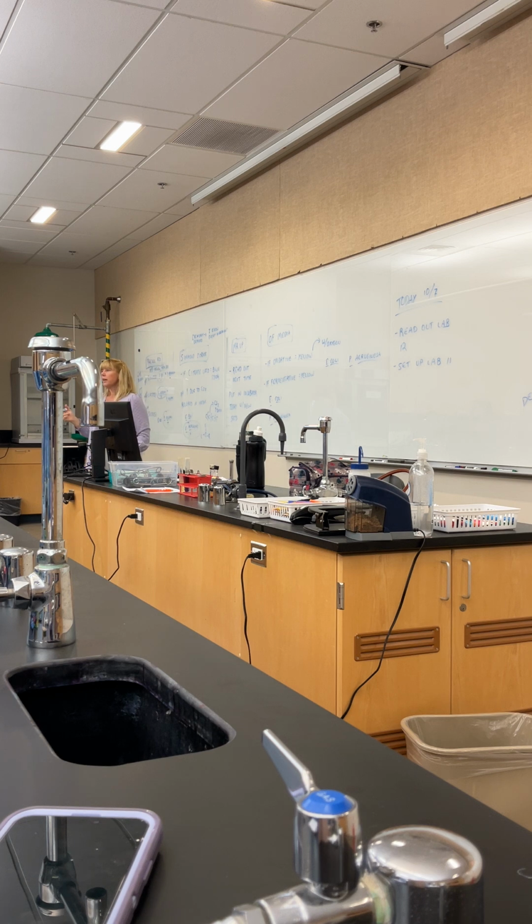That makes sense, right? What did we learn about Pseudomonas in our lecture? What kind of atmosphere does he prefer? Yeah, he's aerobic. He's an obligate aerobe, just like us. All right. So Pseudomonas is going to turn yellow, and so is E. coli. Now E. coli turns yellow throughout. Pseudomonas turns yellow at the top, but they are both going to be positive. All right. How about fermentative?